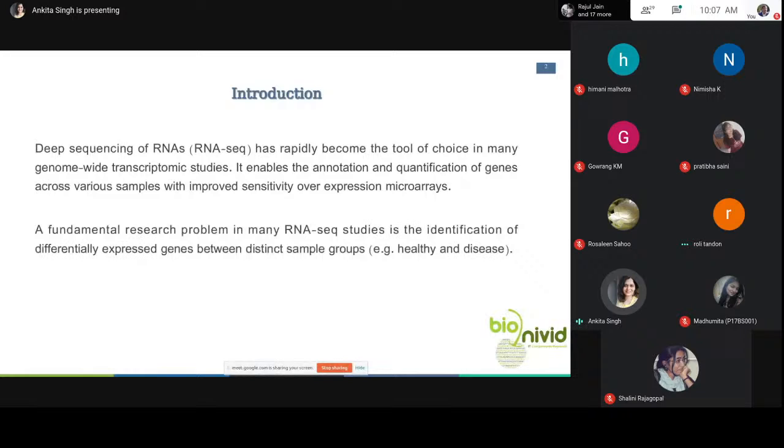There are many different applications which generate our data, and wherein we can find the usage of performing a differential analysis. Be it like in metagenome, we generally have different species, and then we say that dependence at one particular level and one particular environmental condition and at another.